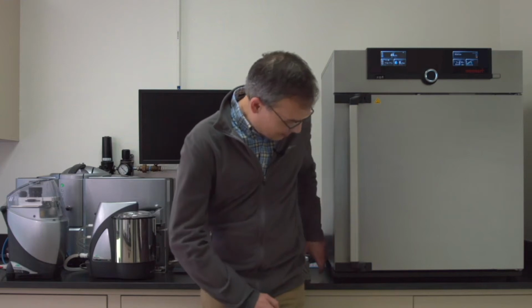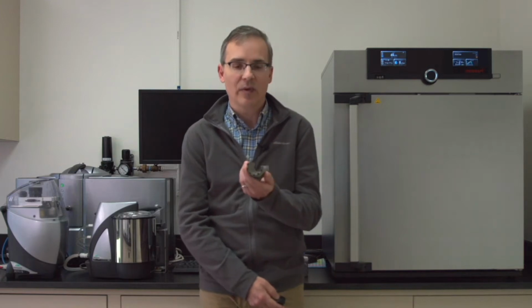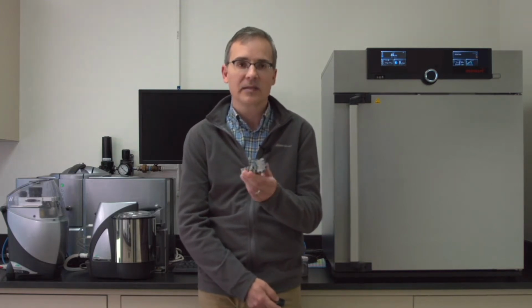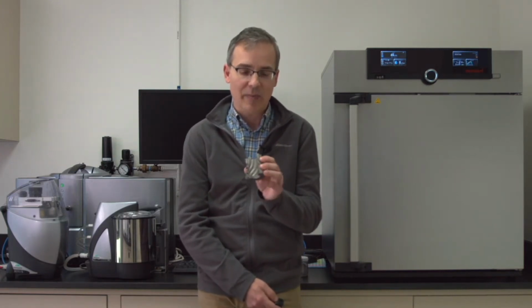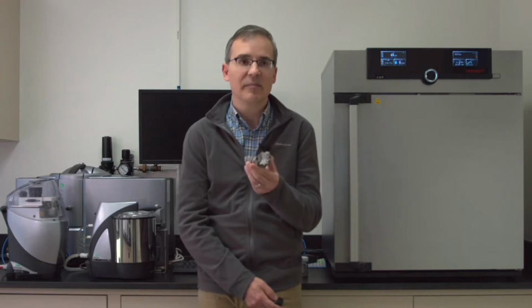So when we talk about metal additive manufacturing, quickly, I'll just give a brief intro about what that means. So additive manufacturing is 3D printing. Have a demo sample here. So here's a 3D printed metal specimen that was made with powder metal and laser, what's called laser powder bed fusion. So you can see it's a fairly intricate structure. It's made from a single solid piece of metal.